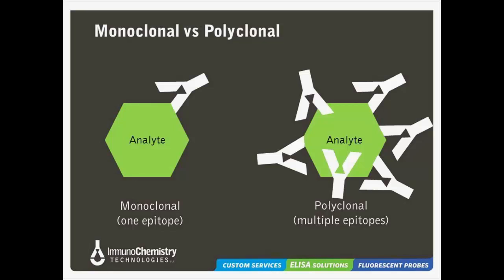Now, on this slide, we're looking at mono and polyclonal. You all know what they are. Monos have some advantages. You get uniform specificity, uniform affinity, and this is nice. If you're really producing an assay, especially a commercial assay, you want this type of thing. And if you don't let your liquid nitrogen tank dry out, like I've known people to do, not myself, you'll have a reliable supply of monoclonal antibody in the future.